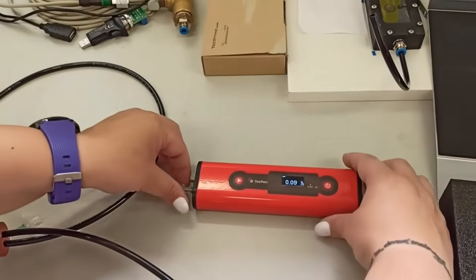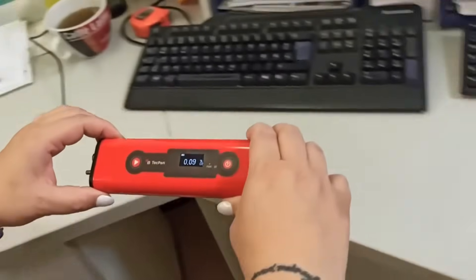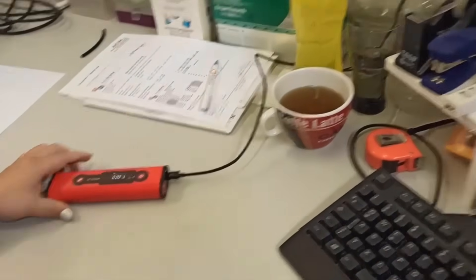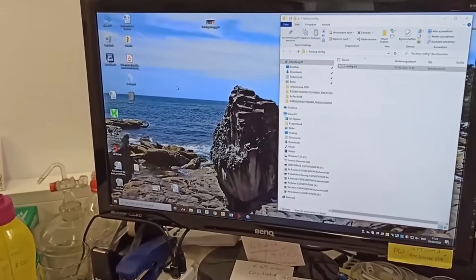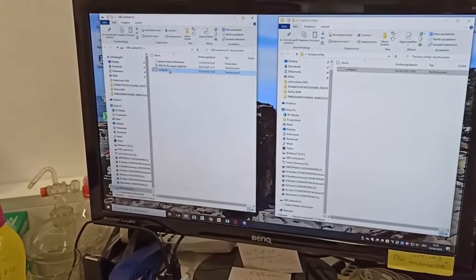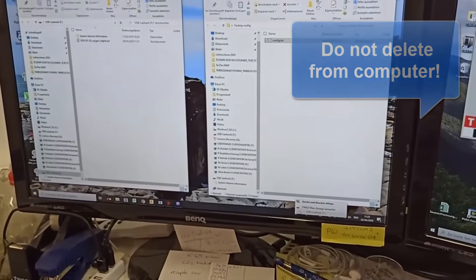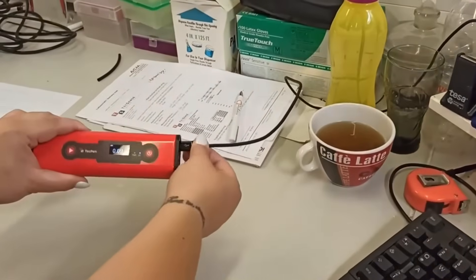Disconnect the TechPen from the Nitrogen and reconnect with the computer. Delete the config file from your TechPen. Remove the TechPen safely from your computer and disconnect it from the USB cable.